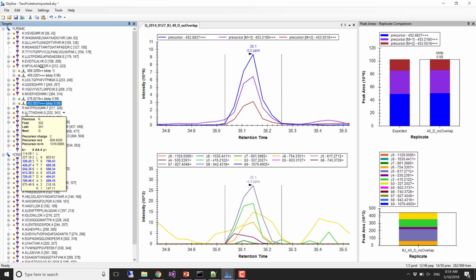on 1 transition. But statistically, if you're going to throw it in with thousands, tens of thousands of other things, then statistically we think you should have 6 or more. Although, actually, there's some software where the default minimum is 4. You guys use just 6 straight through, right? Yeah. There's issues of whether or not you can use neutral loss ions.